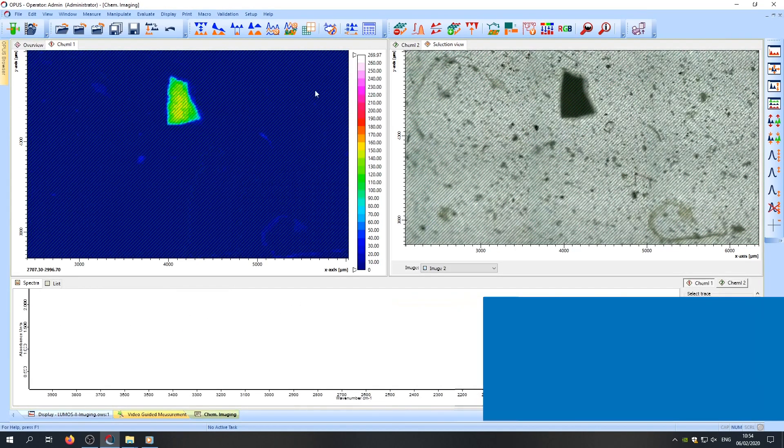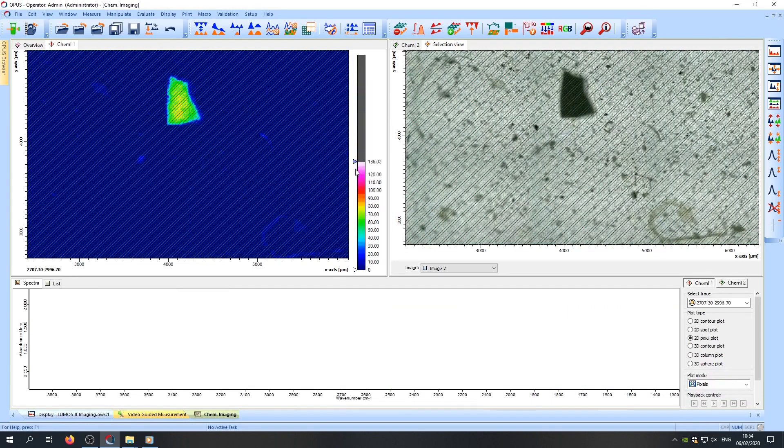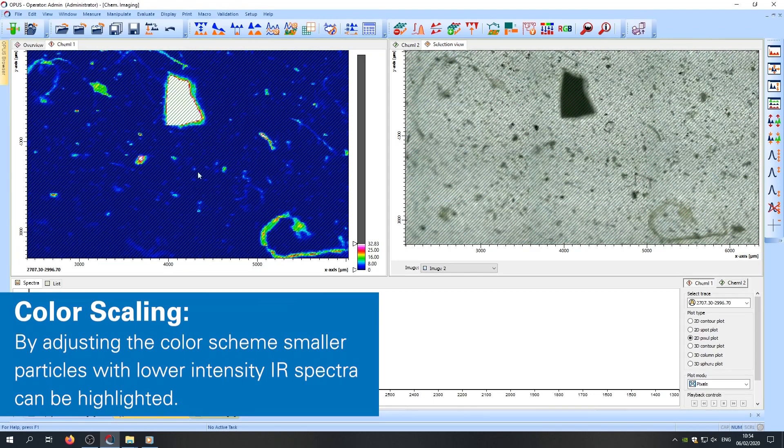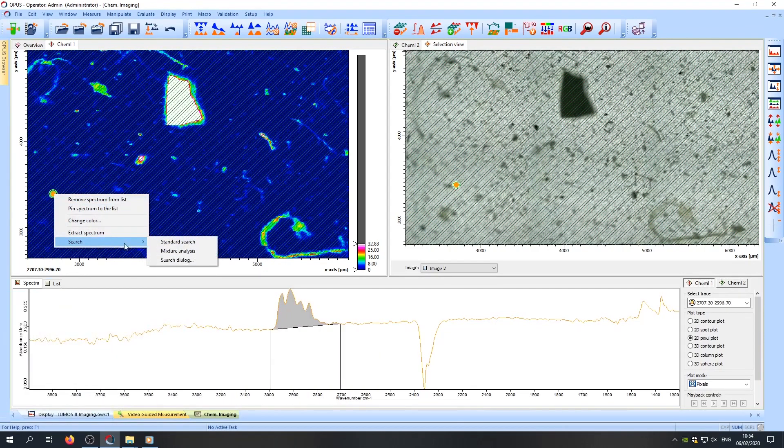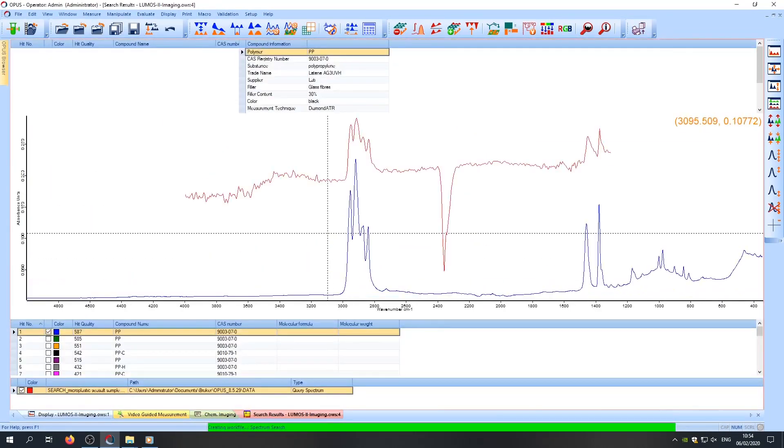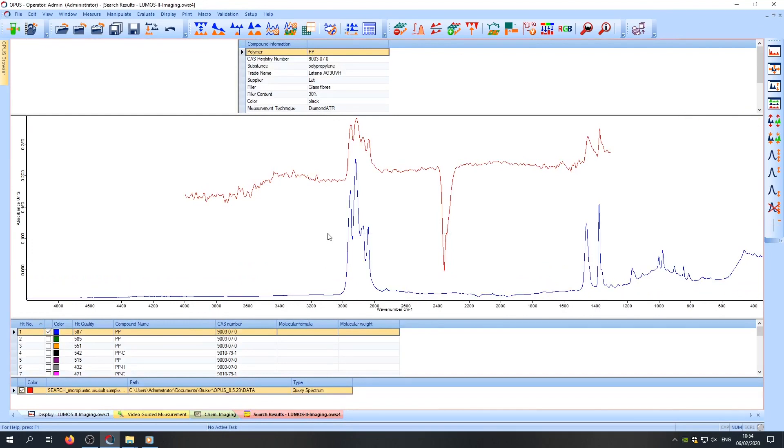If we now want to see smaller particles, we just decrease the color scale and we will see that there is a lot more. And again, just by clicking on the particle, we are shown the spectrum and to find its identity, we perform a library search. And in this case, the particle was identified as polypropylene.